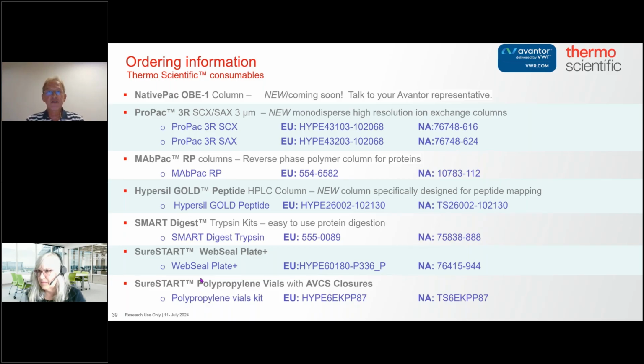The fact that we're not getting miscleavages is another big benefit. But the one you've really got to look to is that it takes a very good, highly trained analyst to do an in-solution digest, and you're doing lots and lots of steps. When you've only got one step, and you don't even have to be that good at pipetting because the trypsin's in excess, from analyst to analyst, from lab to lab, it's a very, very reproducible digest.